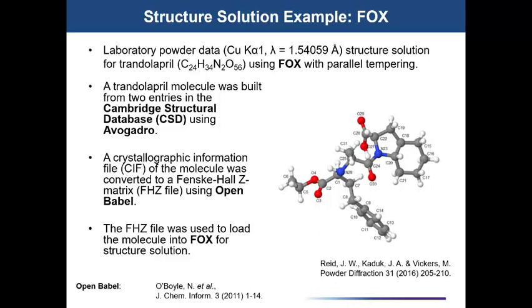Once you have this trandolapril molecule, you can upload it into FOX in order to perform your structure solution. The easiest way to do this is to convert a CIF file into something called a Fenske-Hall Z-matrix. This is very easy to do with a program called OpenBabel. And OpenBabel is a great little free program because it'll allow you to do conversions between dozens of different chemical file formats. So if you use a lot of different software, which powder diffraction people tend to, it's very helpful for getting between different types of formats.